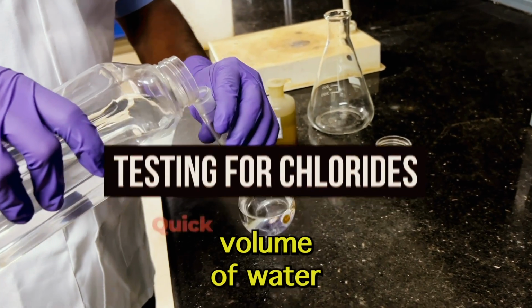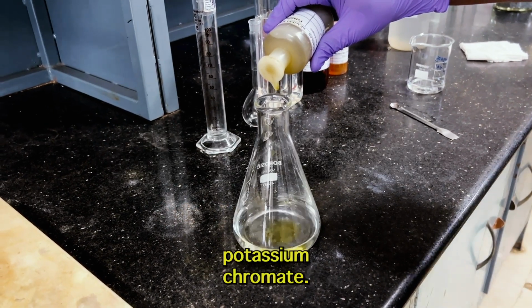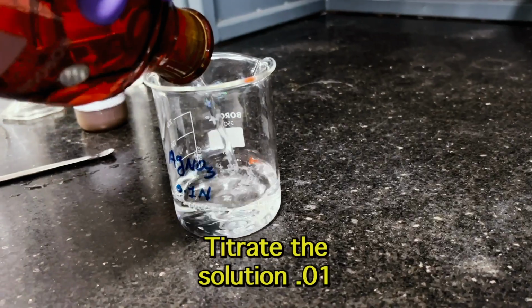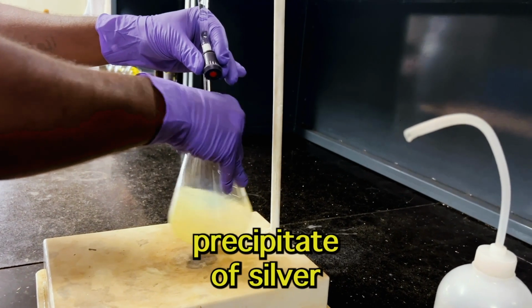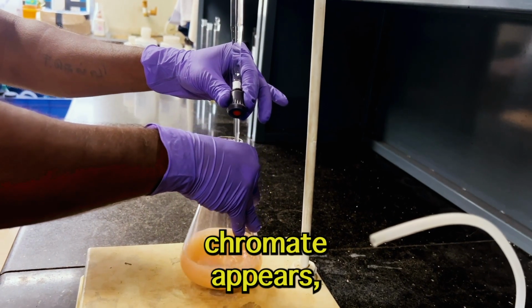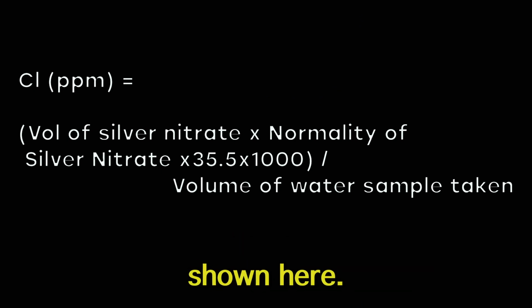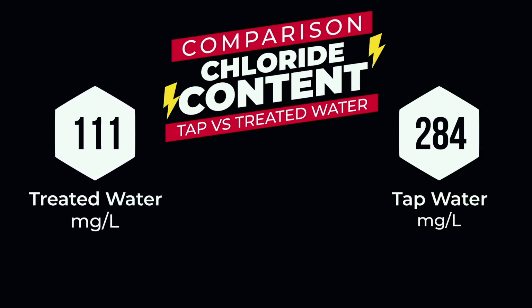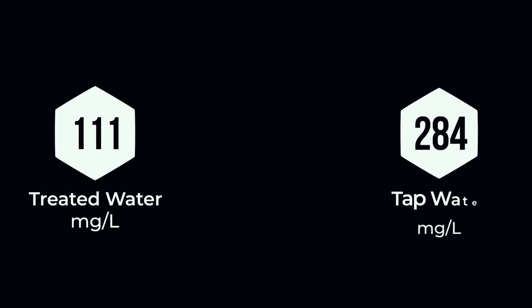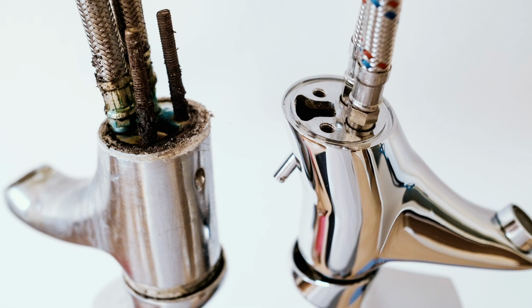Take a known volume of water in the conical flask and add a few drops of indicator, which is potassium chromate in this case. Titrate the solution with 0.01 normality silver nitrate until a reddish-brown precipitate of silver chromate appears. Chloride content is then calculated using the formula shown here. Here are the results of the chloride content for both the tap and treated water. The chloride content in tap water is double that of the treated water. It is no surprise that my taps and bathroom fittings have scales and deposits.